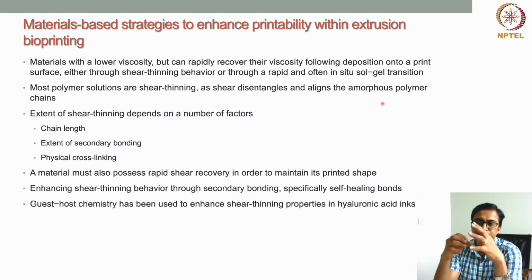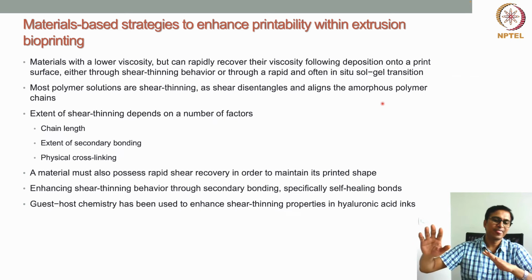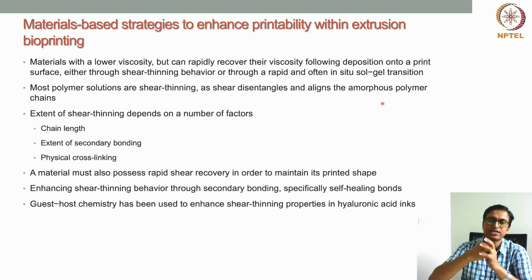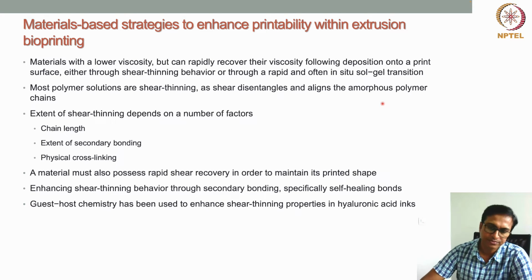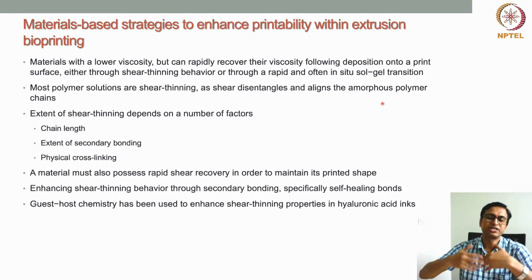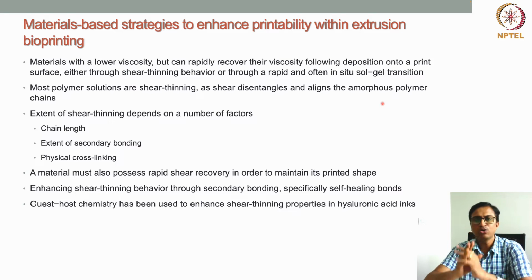But when there is a shear force, that whole hydrophobic interaction can be disrupted and the material can start flowing. Again, when the shear is gone, this host-guest chemistry can help in retaining the shear thinning property. That means at low shear the material viscosity will be high. So this kind of strategy can be very well used to improve the printability of the bio-ink without actually increasing the viscosity very high.